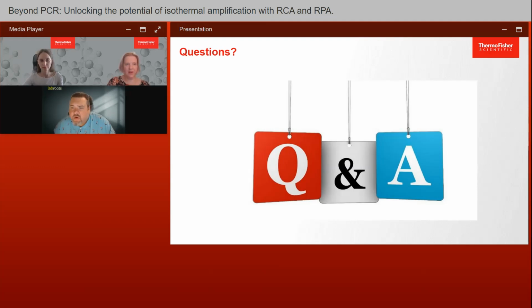All right. Another one for you, Rasa. What is the preferred technique for the pathogen detection, LAMP or RPA, and what conditions should be considered when choosing between the two? Both are widely used and very efficient for detection. For LAMP, as I already mentioned, you need 6 primers. So LAMP assays are more difficult to design, and for some pathogens, maybe it's complicated and you need some bioinformatics analysis for LAMP.